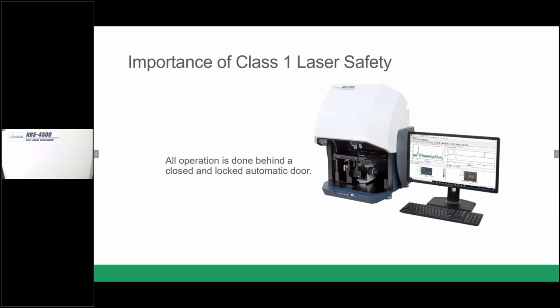The whole instrument is class one laser safety. That means that the instrument is closed and locked when the instrument is performing the measurement of the Raman signal, of course, to avoid any damage or any hazard when the laser is used. Specifically, we mentioned that in our first Raman seminar.